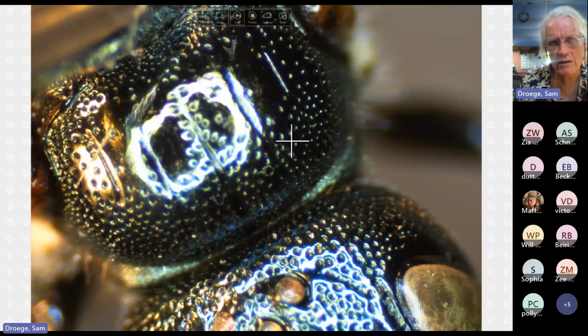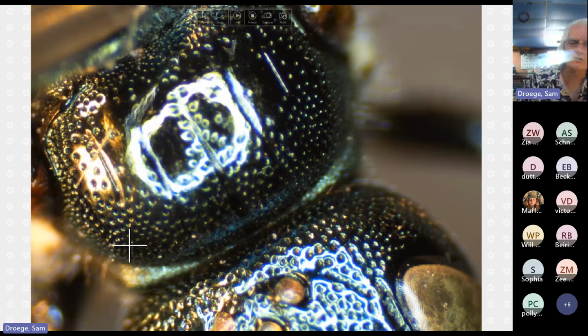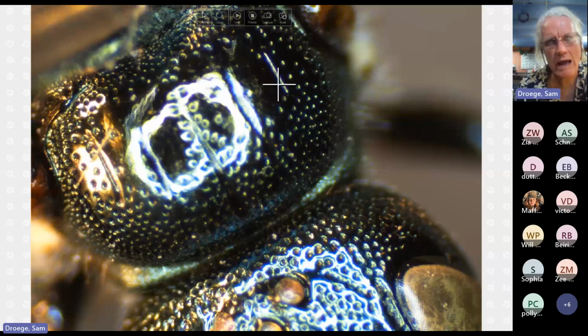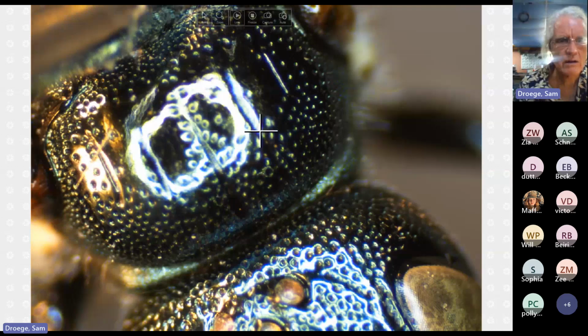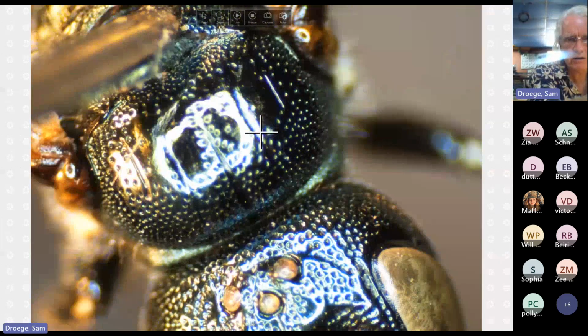I should have mentioned that the interior edge of the scutum is always pitted in all of these, and then it's really what happens along the parapsidal line. Here you can see there are pits, and then there are no pits or one or two pits along the line, and then it's just a big open gap in between. So same as it was.